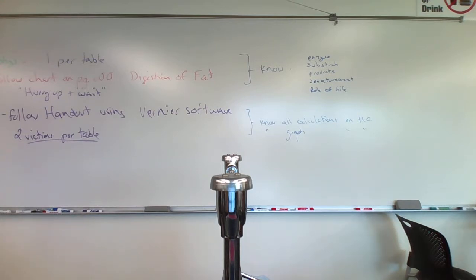Notice tube 3L. 3L is unique because what are you doing in 3L? Boiling lipase. So you put the lipase in alone and boil it, in this beaker here when it finally gets going. You're boiling it for 4 minutes and then adding the litmus cream. Remember biology 112, what does boiling do to enzymes? Denature! So you're going to denature the enzyme and then do the same thing. 4L, 5L. So all these tubes are basically adding 5 drops of each, incubating them for an hour at 37 or at 0.